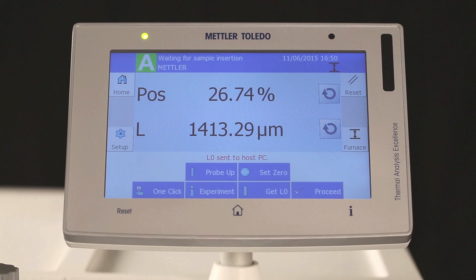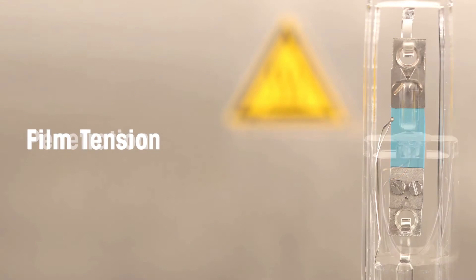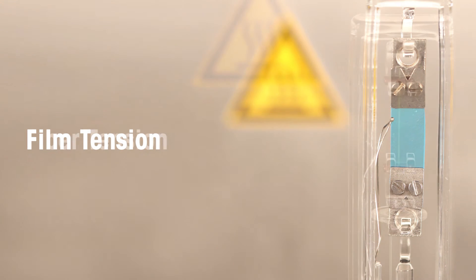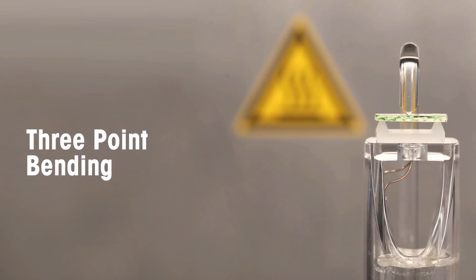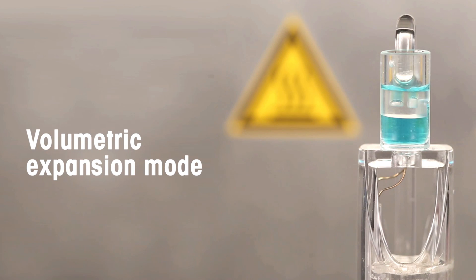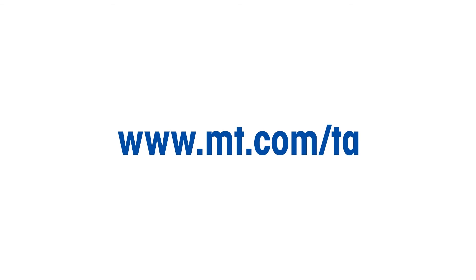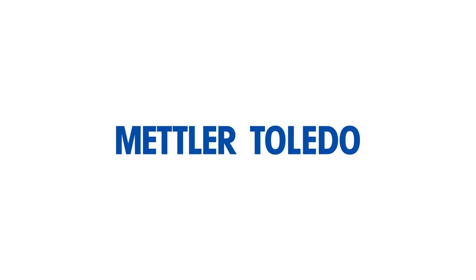We have now shown you how to prepare TMA measurements in dilatometric, penetration, film tension, fiber tension, three-point bending, swelling, and volumetric expansion mode. Further tips and hints can be found in the book Thermal Analysis in Practice. Some of the samples can be found in the tutorial kit.